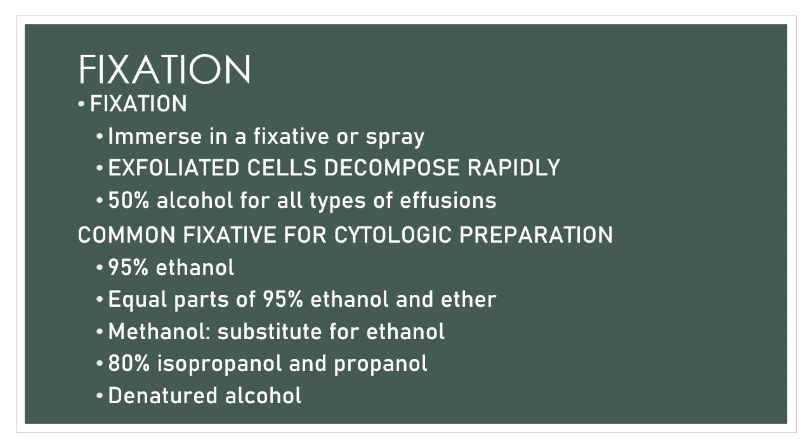You use your 50% alcohol for all types of effusion.